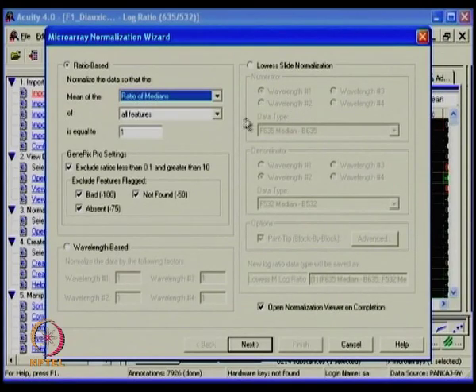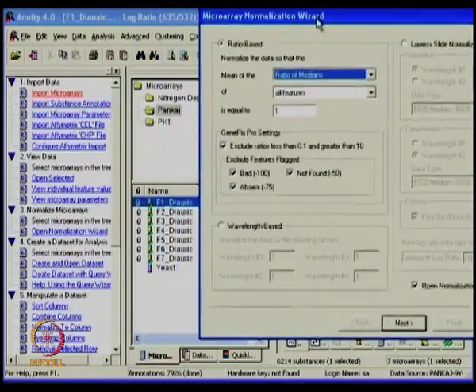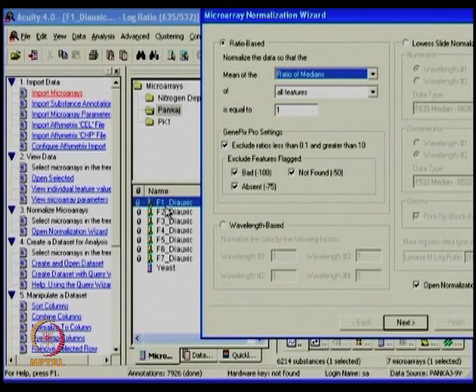It is continuous and it is discontinuous type. One can select, but one has to remember that all my time points have to be normalized in the same way. So you cannot cross different normalizations and compare them, because unless they are normalized in the same scheme, you cannot compare across, right? Because you are going to compare different time points here.